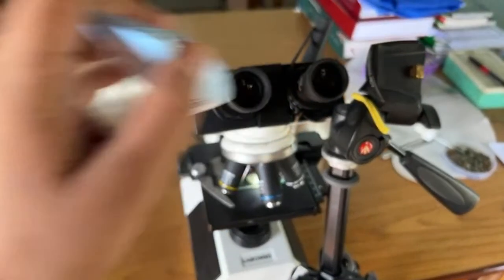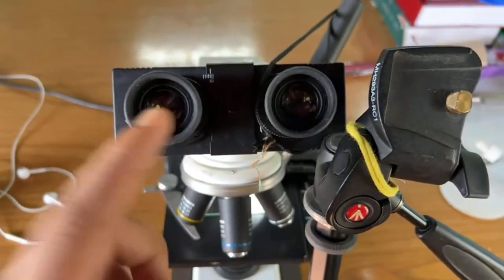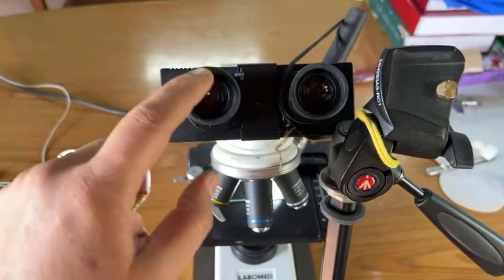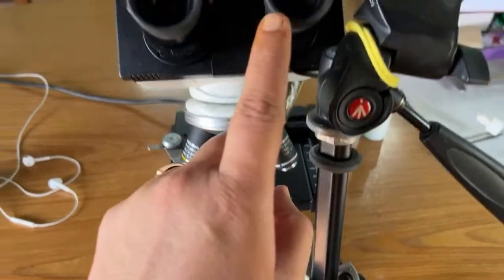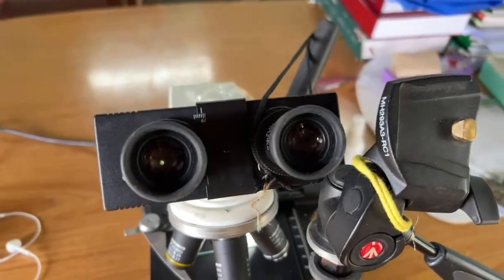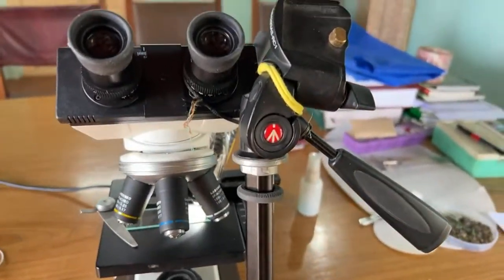Yes, one thing I was saying was the camera was mounted this way, and this was laid open. So what was happening is that all the light that was gathered by this eyepiece was also being reflected back into this one, and we were getting those different fringes, those rings, that light pollution in this particular view.